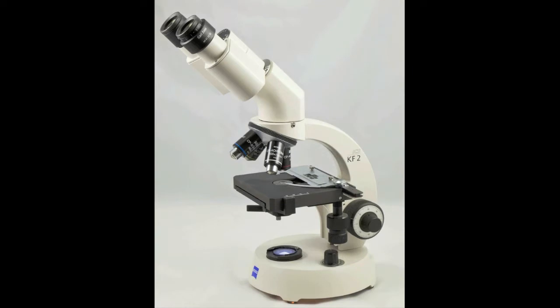Let's begin by looking at the parts of the microscope and their functions. The base of the microscope is broad and heavy in order to provide stability. This, together with a sturdy table, reduces vibrations and facilitates a clear view of tiny objects.